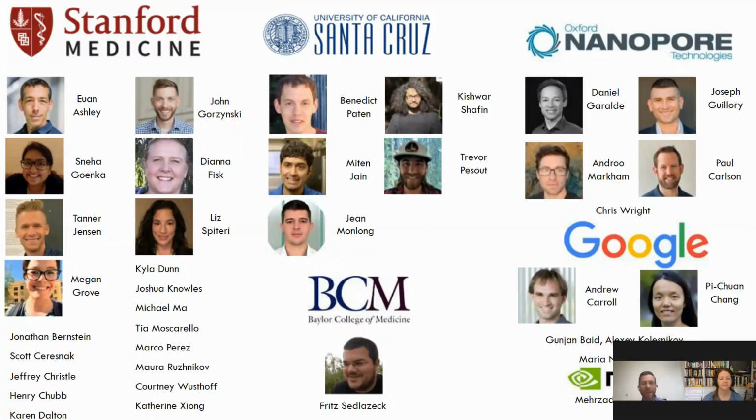So, if we're thinking about a primary tumor or a metastatic tumor, we need to sample that tumor itself in order to get the DNA that's going to be most relevant to these types of diagnostics. So we certainly could apply this technology to cancer diagnostics and make a really quick diagnosis in terms of mutations that may be causative of the cell proliferation, which causes the cancer itself.